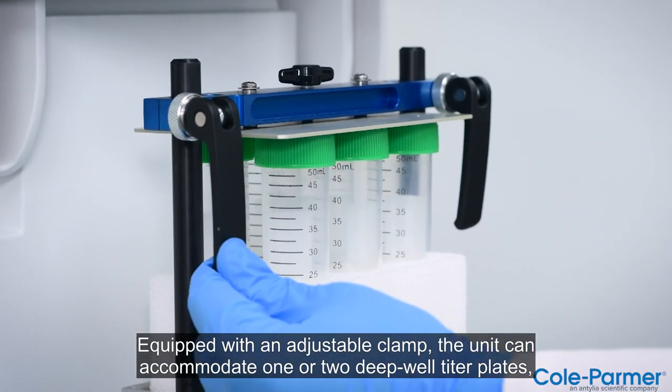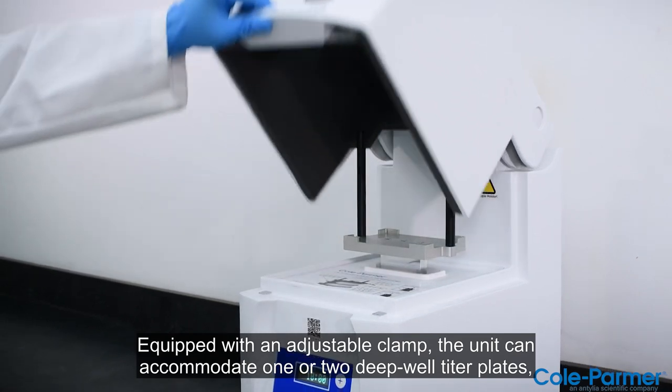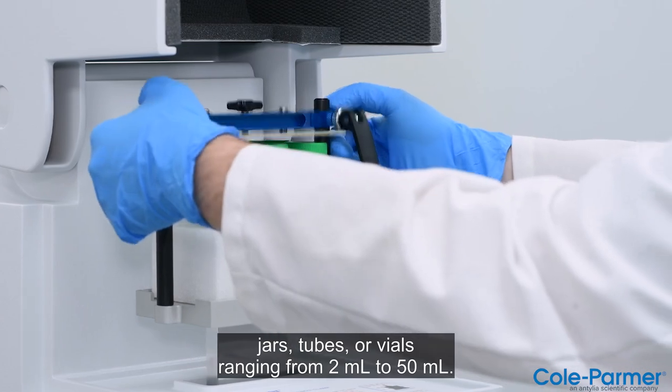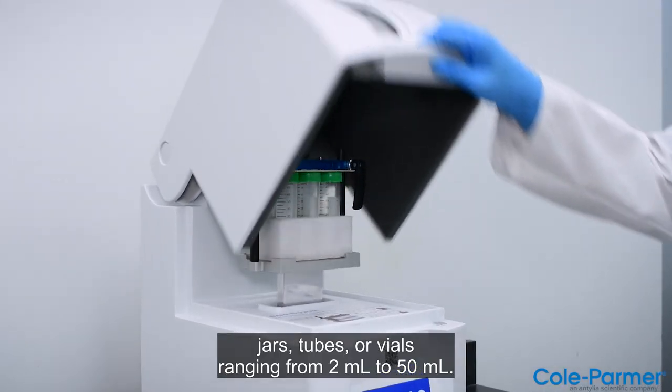Equipped with an adjustable clamp, the unit can accommodate one or two deep-well titer plates, jars, tubes, or vials ranging from 2 milliliters to 50 milliliters.